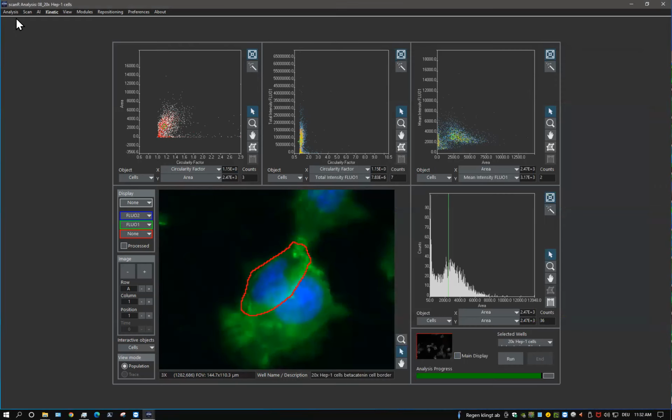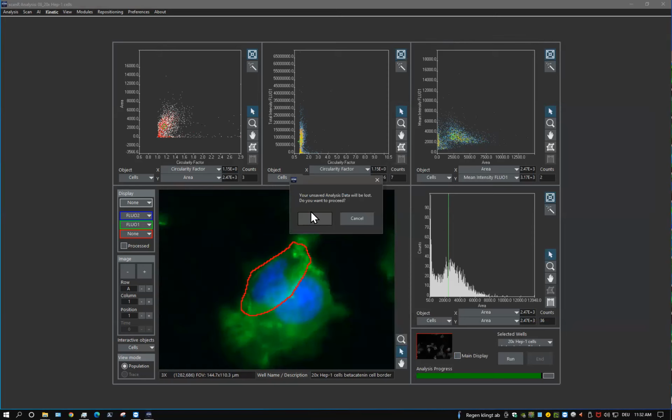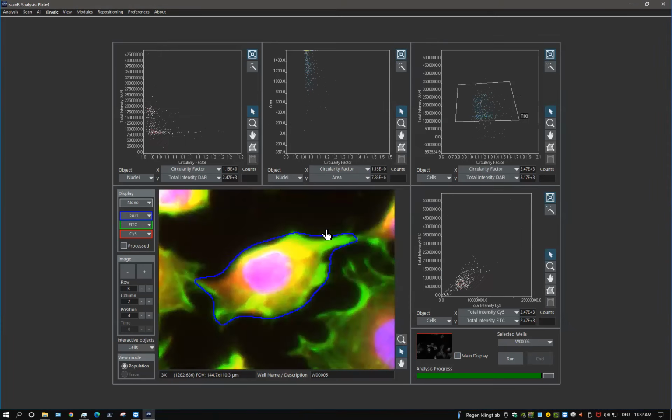Okay, let me finish or finalize this demonstration with something I want to show, because so far I only showed segmentation on one channel. Of course, this also works on multiple channels. I will rerun this here to give you an impression of the time it takes. There are only a couple of images. Let it be like 10–15 images, just a demo set.